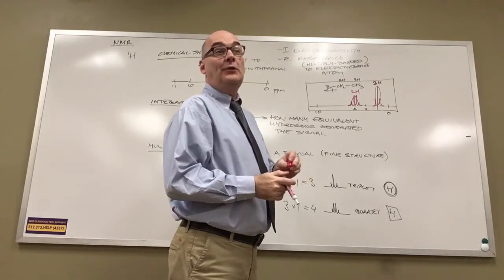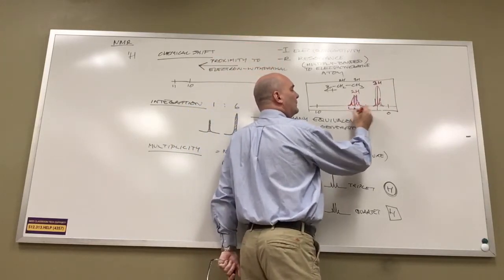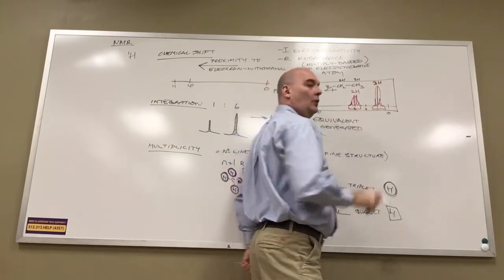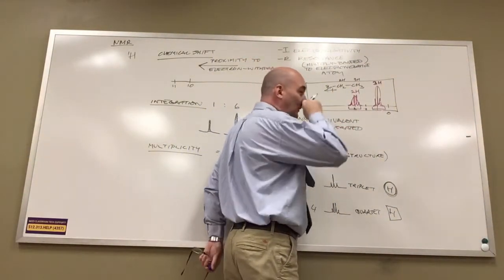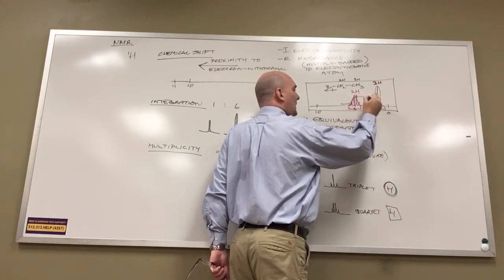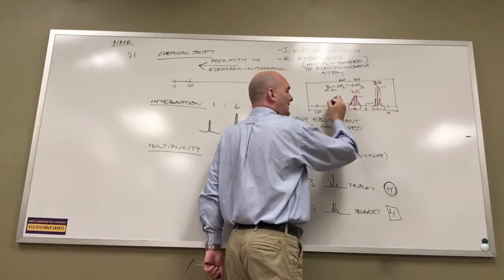And depending on the vintage of the data that you're being shown, some of them write the integration in a little box underneath the signal. Some of them write them above. Or if you go way back, the integration used to, when it was ink plotters that generated the signal, you would have a second pen that would make a second pass and give you a sigmoidal curve, and you would have to measure how many little boxes, because it would be a graph paper.